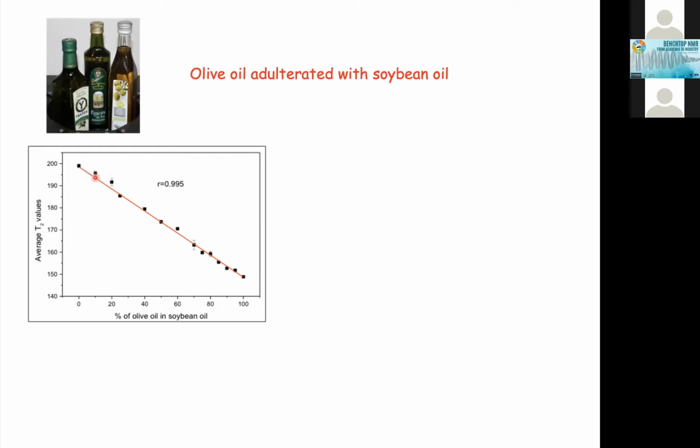That's a fraud, yeah, because it's not on the label. You can have 10, 20, or 50%, and sometimes in Brazil most of the adulteration happens in this area here because people want to make a lot of money, okay?